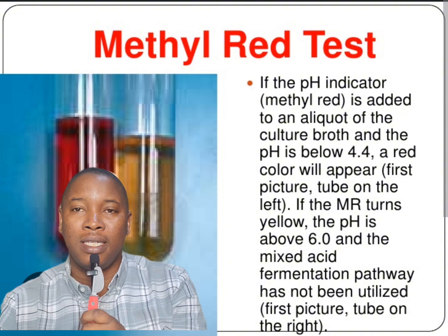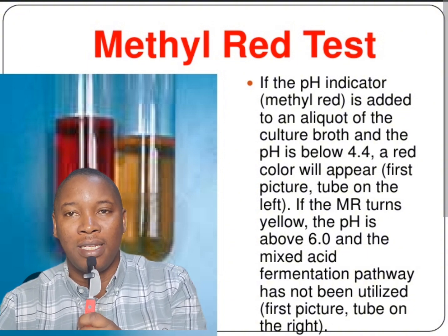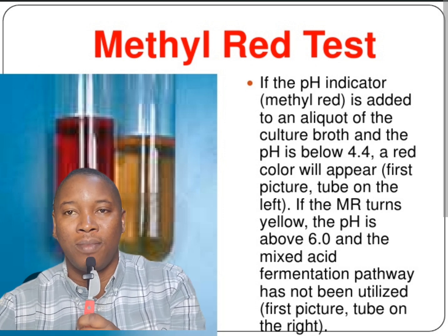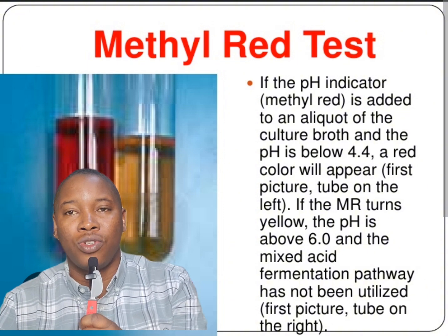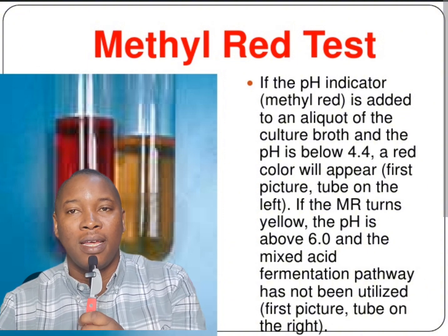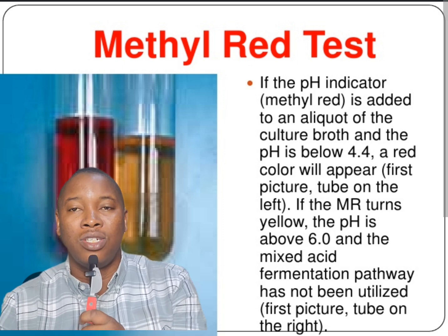So the production of these four different acids by this organism, when they come in contact with glucose, significantly lowers the pH of that medium. If the pH of that medium was neutral, at 7.0, or maybe even slightly alkaline, the fact that these four different acids have been produced within the same media drops the pH.